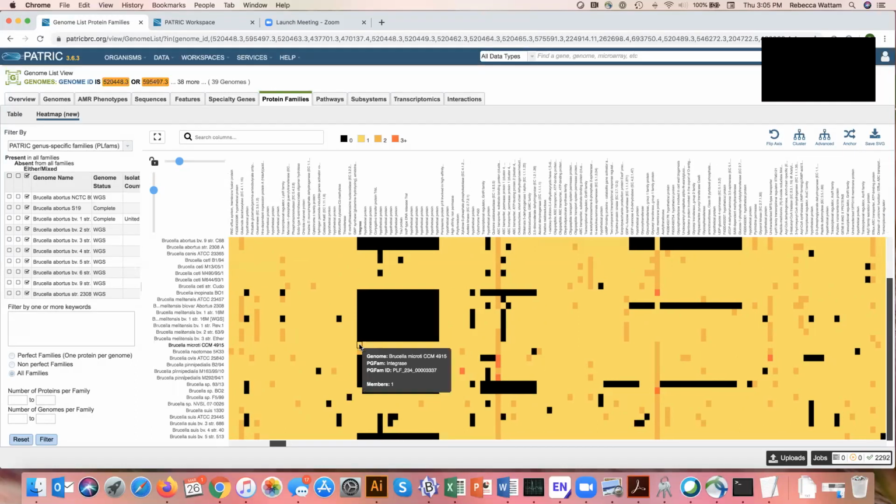But watch my cursor now. I'm drawing, you see that blue square? Drawn over that in the microti genome that matches that area. Okay, so I've drawn that there.